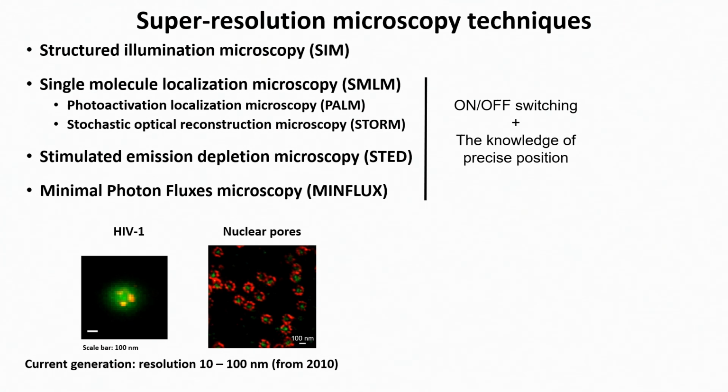So this is not actually a new technique. This technique is well established, and more microscopes actually come with this set of techniques built in by default. So for any new microscope that is purchased right now, there is a good chance that it will include a super resolution modality. So it's no longer confined to physicist labs or a small subset of groups.